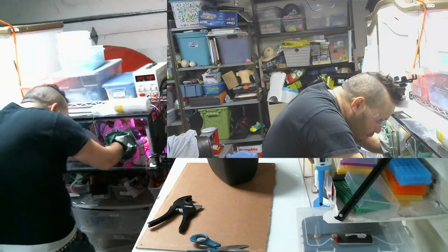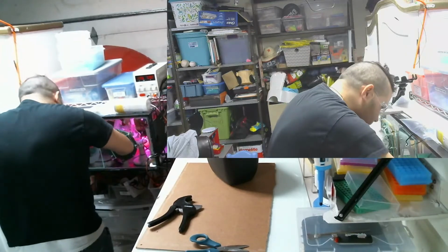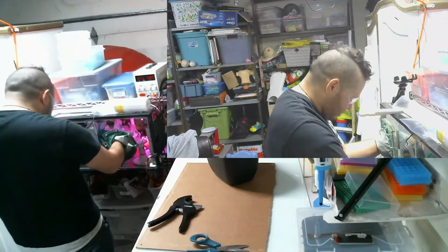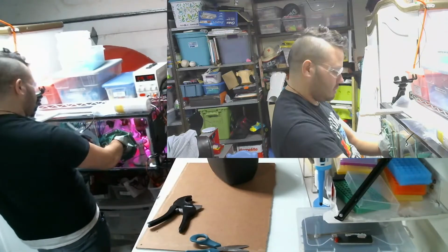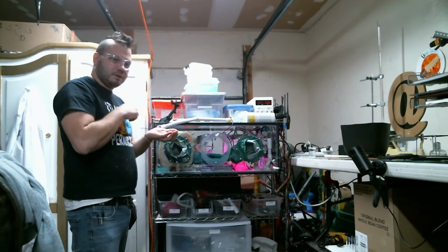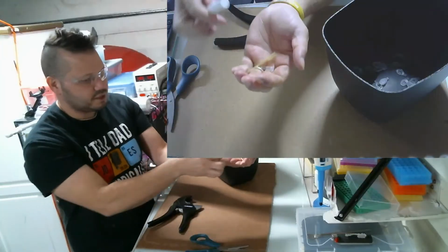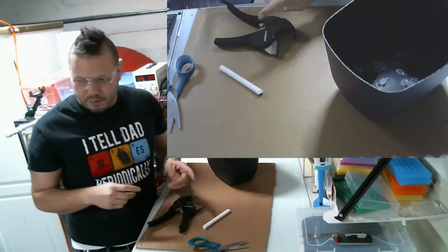and I remove 100 microliters, which is a tenth of a milliliter, and I put it into a centrifuge tube. Now I have a little PVC pipe, which you'll see in a minute, which I use specifically to transfer samples out of here without having to open up the big door. Now I open up the tube here, and I have the sample, and in there as well is the centrifuge tube. As you can see, it's a PVC pipe, pretty simple thing. I melted the end of it. That way I don't have to open it up.